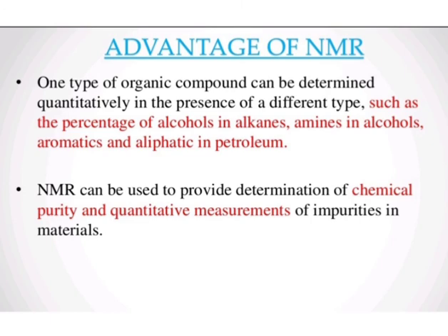So this is used for structure determination, quantitative analysis, and is helpful for finding the purity of a compound or finding impurities. So this is all about NMR spectroscopy. Our H1 NMR is complete now. We will learn the carbon 13 NMR in the next lecture.